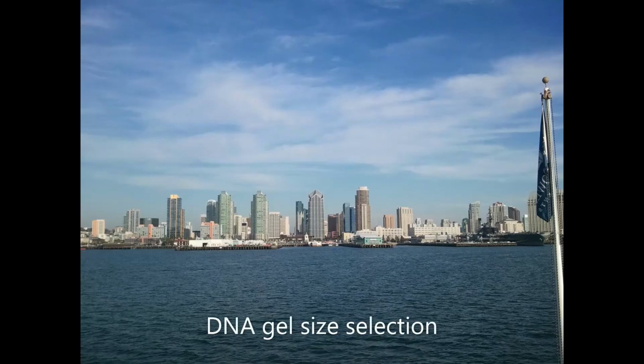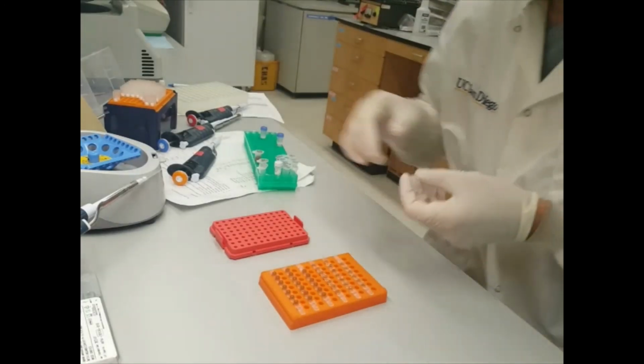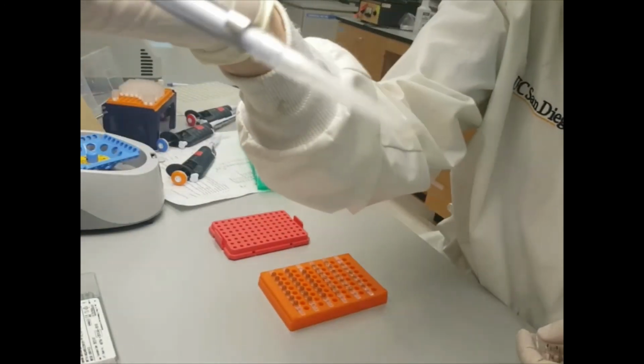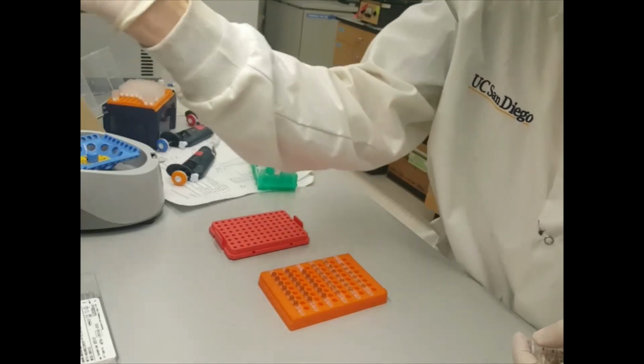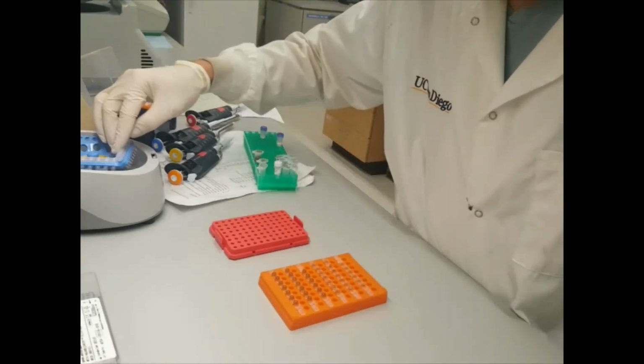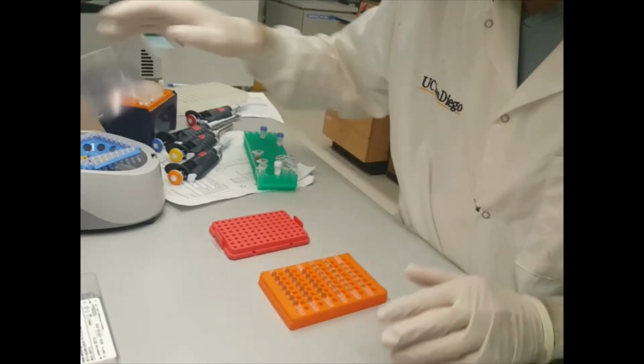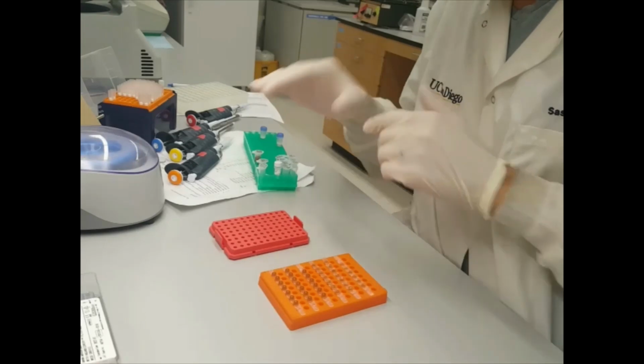Prior to loading the PCR onto the gel, I highly recommend a bead cleanup. This is to remove excess salt, which allows the DNA to run in a sharper pattern on the gel. For csRNA-seq, this size separation helps to accurately avoid both adapter dimers as well as the occasional 51 or 60 long nucleotide small RNA that might have slipped through the protocol.